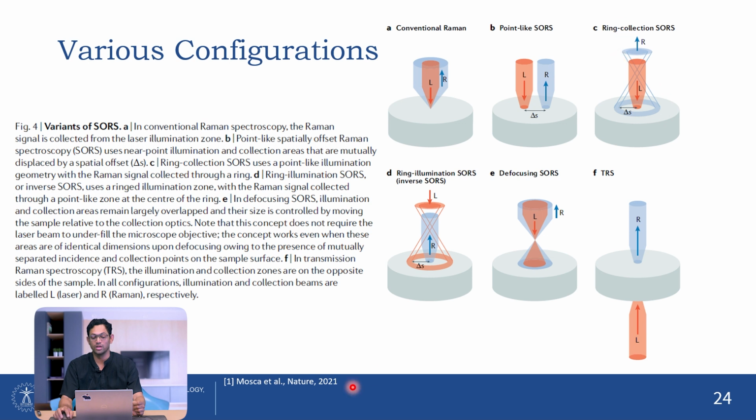The opposite you can do: you shine the light in an annular region surrounding the tissue, and in the center you detect the back scattered light, which propagates inside and then comes out. Okay, so here you can see the light source is going to come in and get back scattered, and then you can detect that light over here.